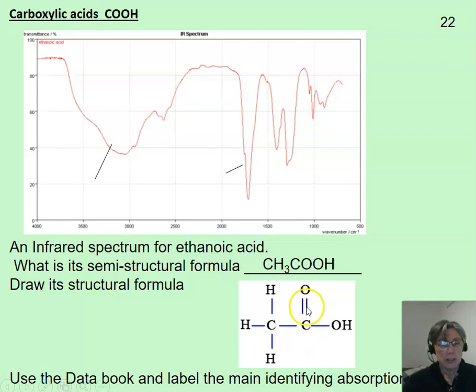Particularly if it's with a carboxylic acid and another carboxylic acid, we get a dimer, with 2 hydrogen bonds. Okay, so they're the peaks that you need to recognize. So it'd be good to pause this and at least draw a picture of this.